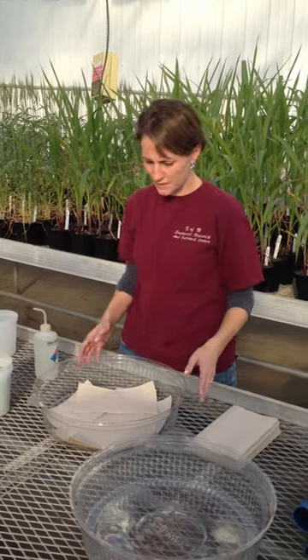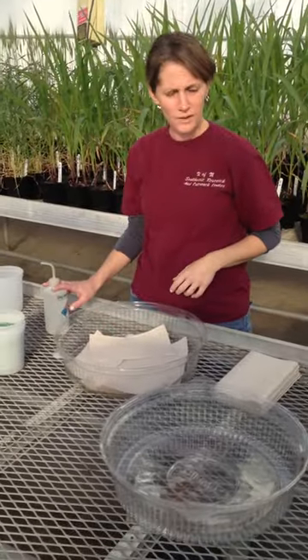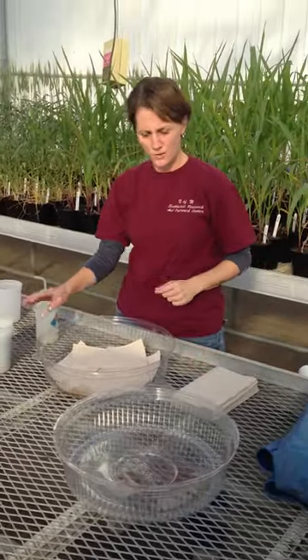To set up your seeds for germination, you're going to want to have a couple of plastic trays, a water squirt bottle, some paper towels, and of course your seeds.